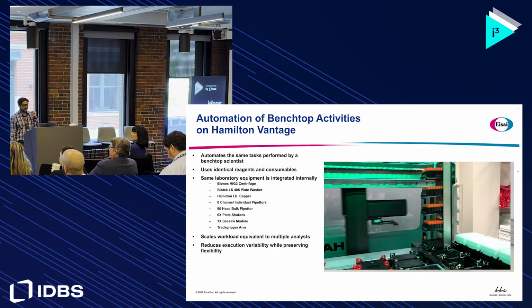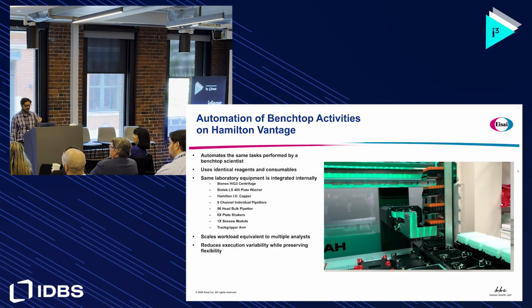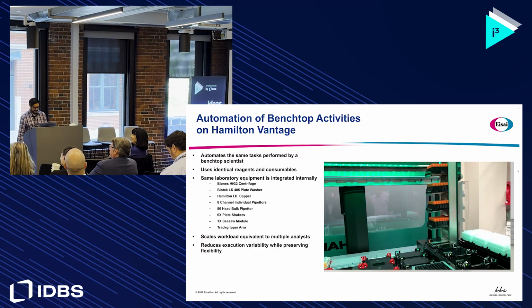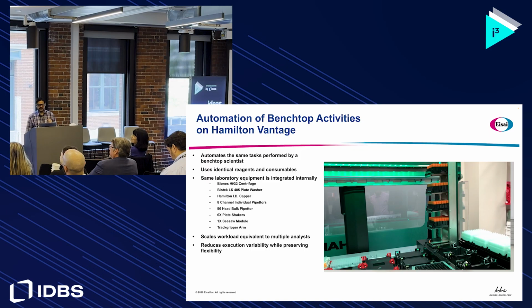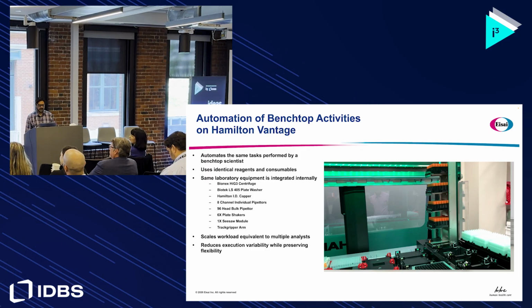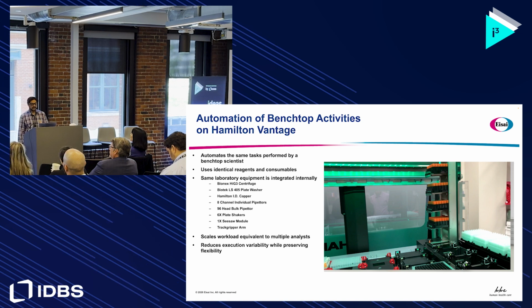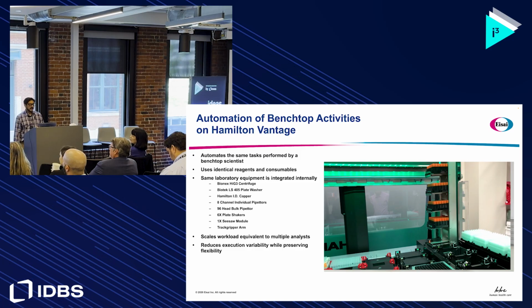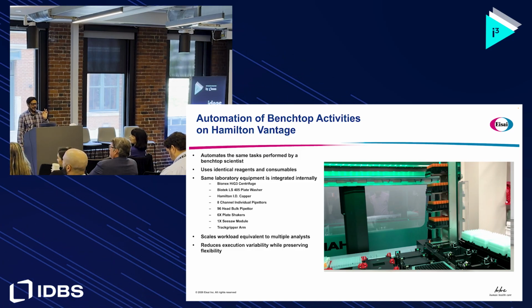And now we have my robot, my Hamilton Vantage. It's my baby. We've been together for a very long time. I think I got it 2014 is when we started our journey together. And it is a workhorse. It works every day for me. I don't get a lot of time in the lab, so it does a lot of what I do in the lab for me, which is fantastic. And I'll get to that in a second.